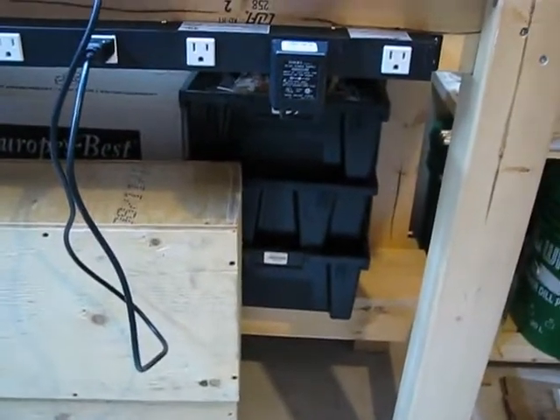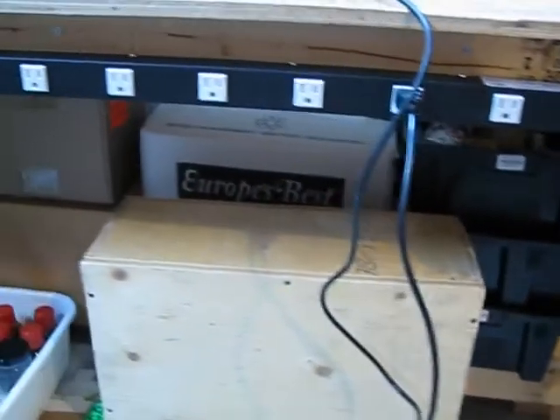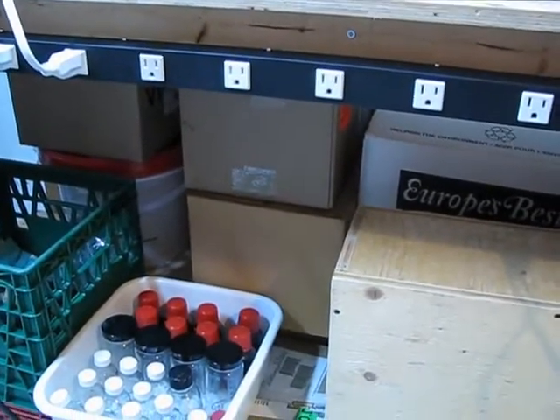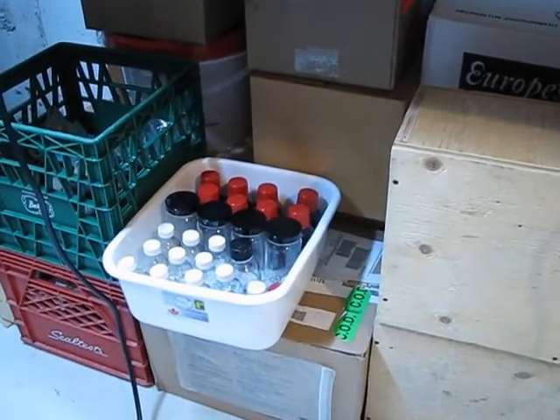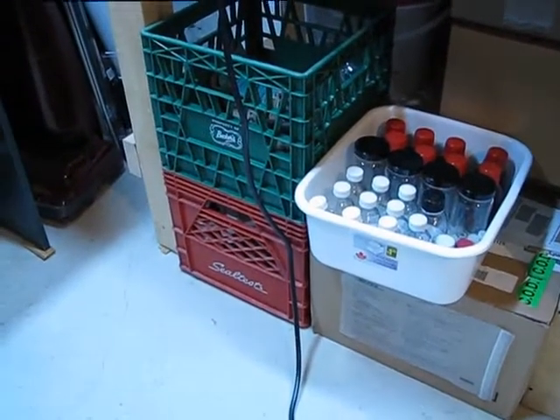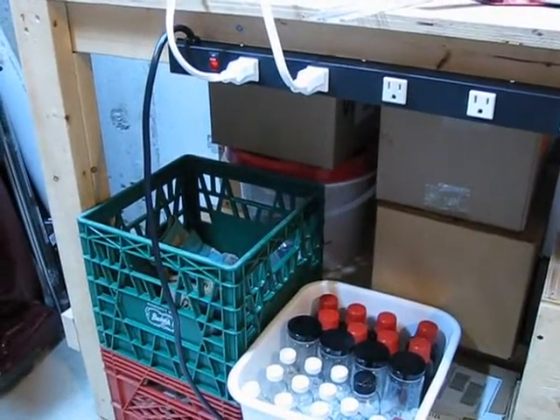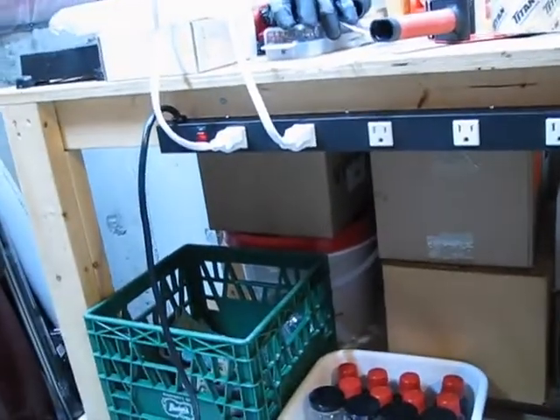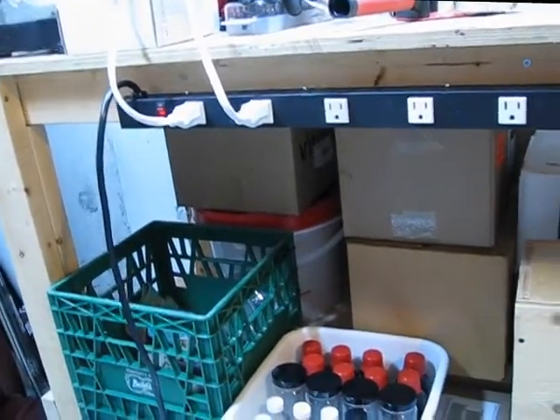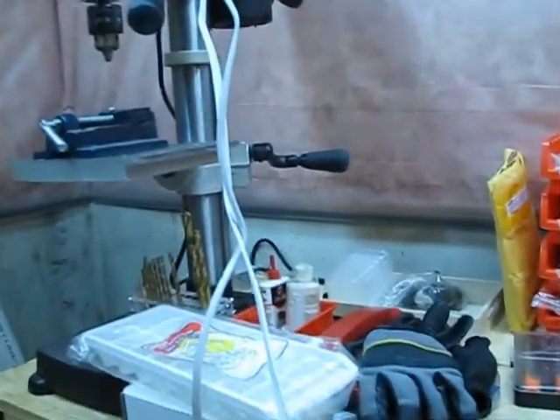Down below we have the interesting glassware — all of this is ground glass jointed. We have some more stuff in storage that I have yet to unpack. A whole pile of empty bottles for sample storage, work gloves and other things in this green crate, a couple more chemicals, and miscellaneous items. Note these two power cords — they go to the newly installed shop lights.